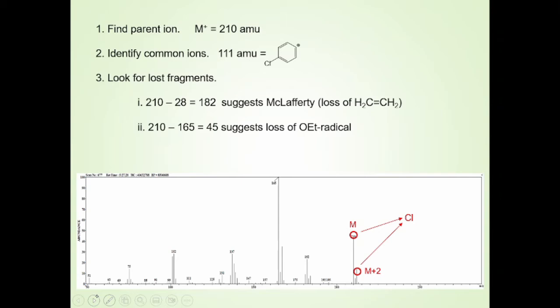In fact, bromine would be a little trickier still. The mass we get there, 79.9, rounds very close to 80, but there is no bromine 80. It's either bromine 79 or bromine 81. And so you would actually get two peaks in your mass spectrum. If we had bromine, we'd get an M and an M+2 that are roughly equal size.